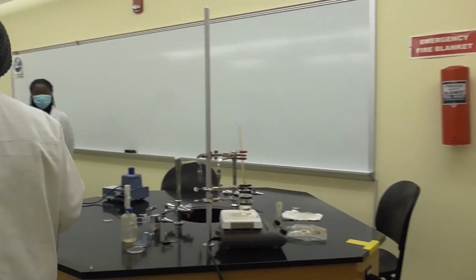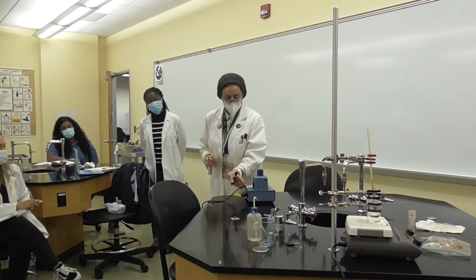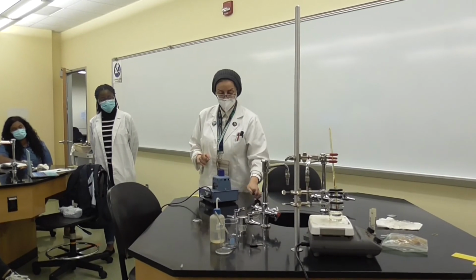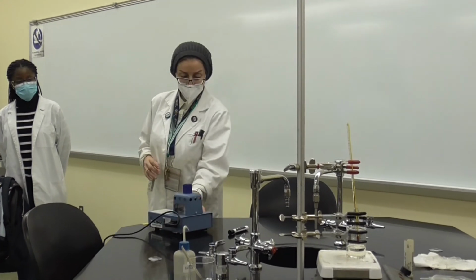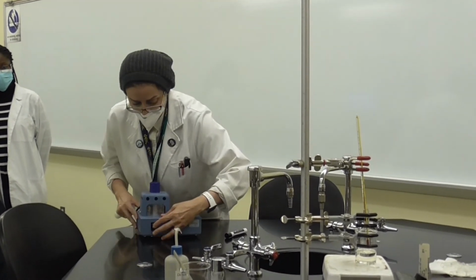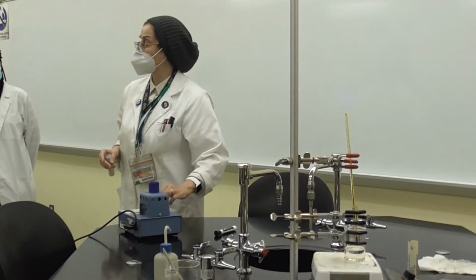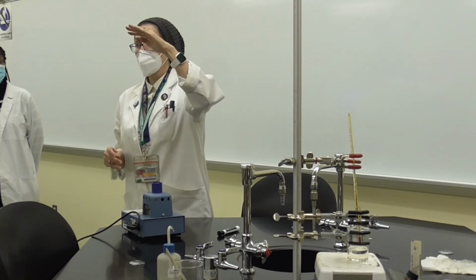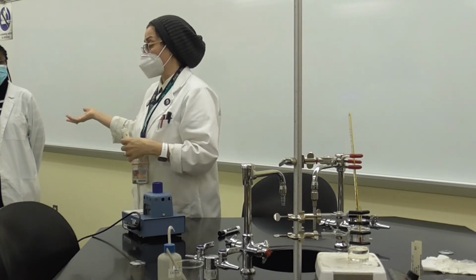The other one is the melting point. We have this melting point apparatus. You have the reading here. Just follow the reading. It's very clear and stepwise. First we're going to have it opened here, this is on and off. But before you open it, you have to read the instruction and set it up on the level of the melting point, the highest melting point that we are expecting.